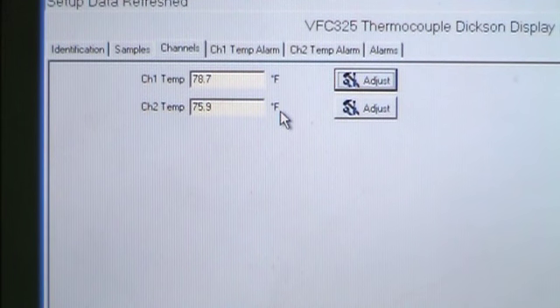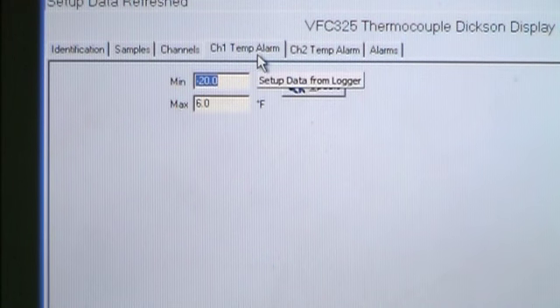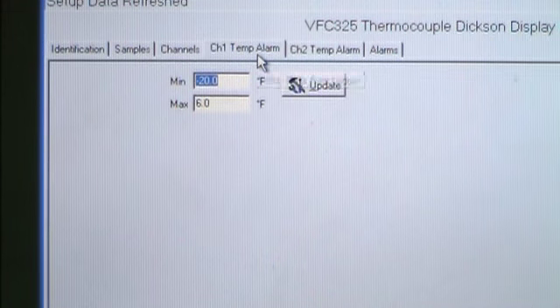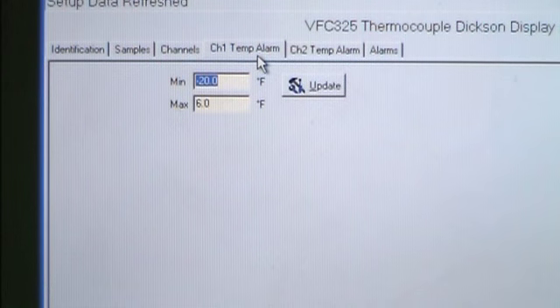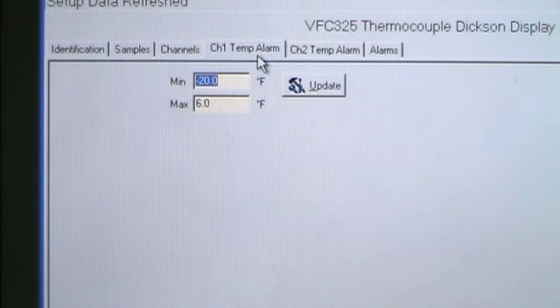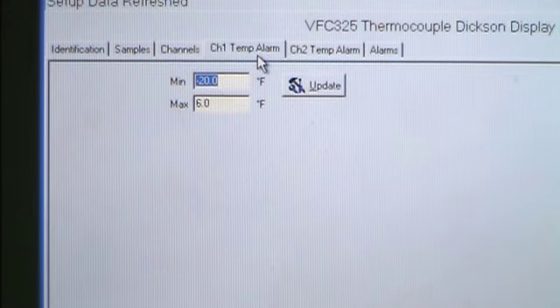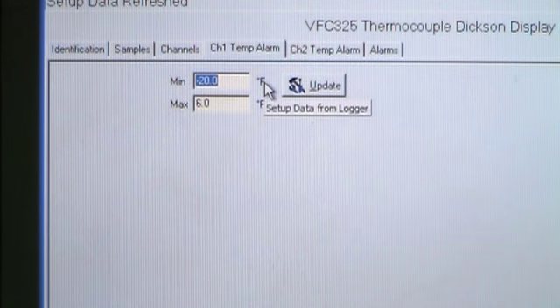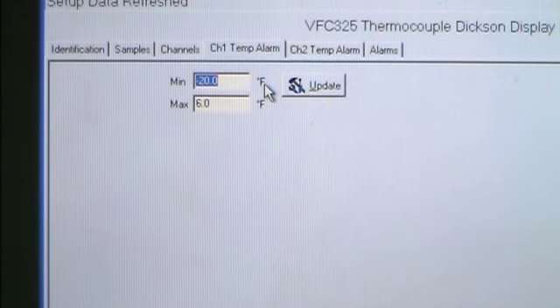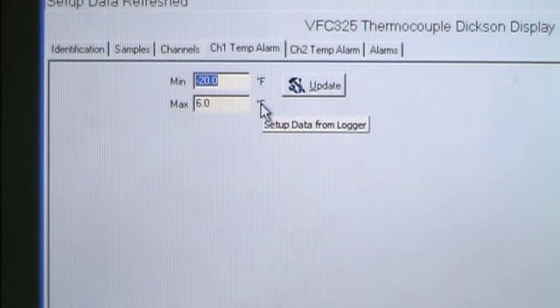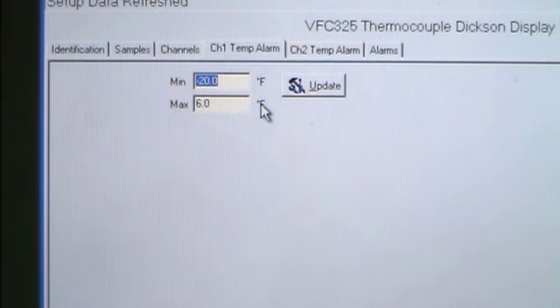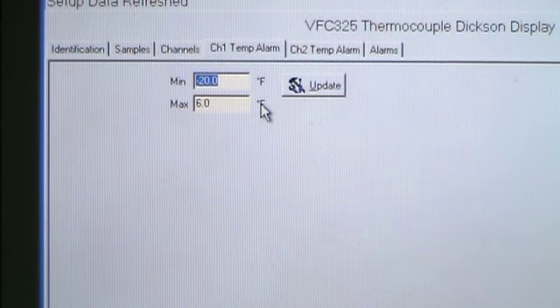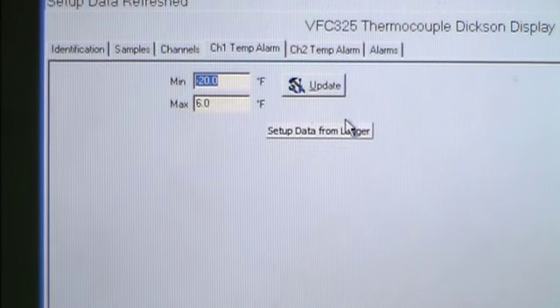Choose the Channel 1 Temp Alarm tab to set the Min and Max alarm conditions for this channel. For the VFC325, the alarm defaults are Minimum Temperature negative 20 degrees Fahrenheit and Maximum Temperature 6 degrees Fahrenheit. To make any changes, type in a different temperature into the box and click Update.